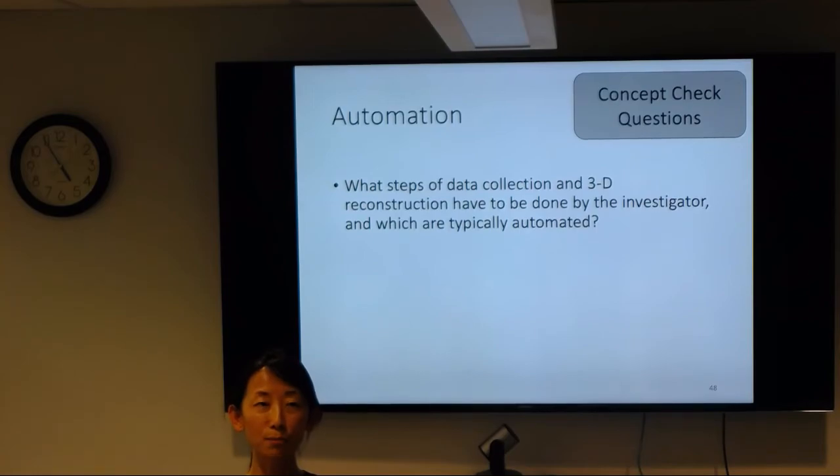You have to manually transfer it to an electron microscope. Once you clip it and load it to the microscope, changing grids, you have to click a button, but it's pretty much automatic. Then you have to manually check your grid to see the quality and find your target. You do that from 9 to 5 every day.